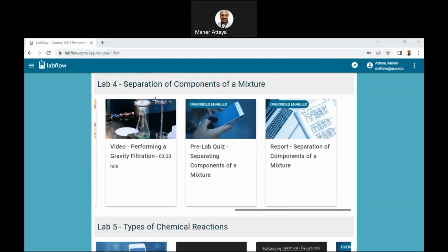So this is the actual experiment online.